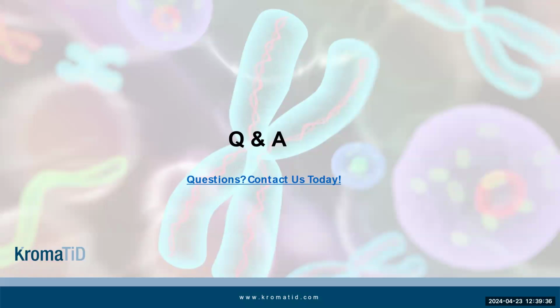This presentation really didn't touch on the FISH capabilities of some of these methods that we have, because we're starting with the bioinformatic design of synthetic probes. One of the interesting benefits of doing it that way is that you don't need that BAC library. You don't need to have bacterial cultures in the freezer.